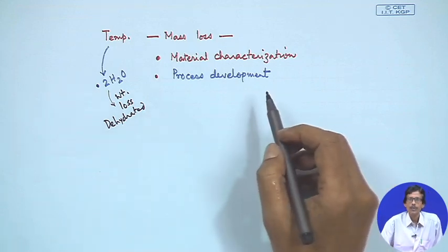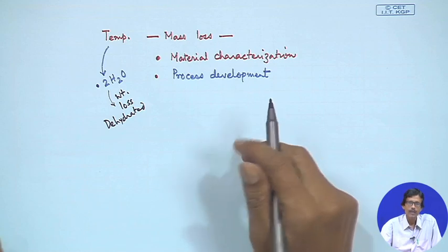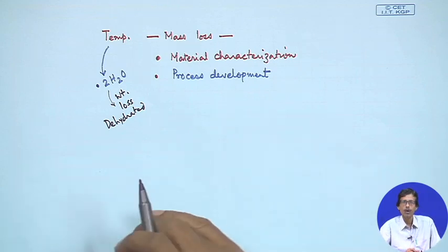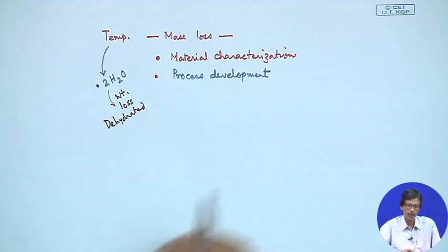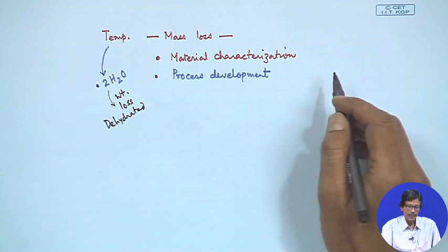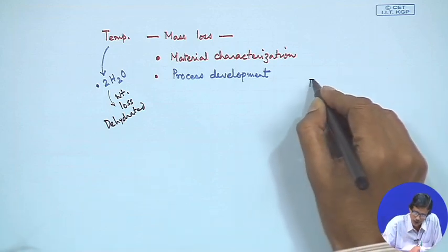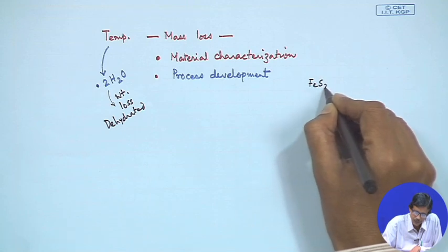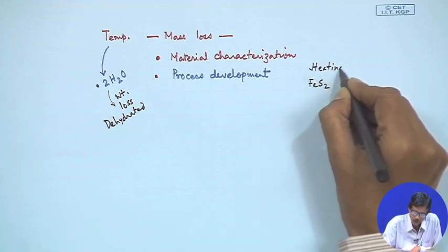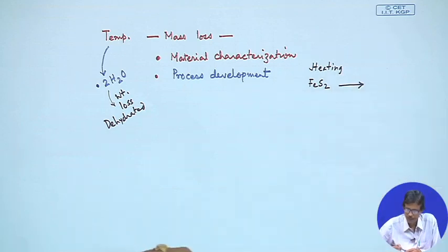So, after knowing this, the dehydration process can take place, and if we have more water molecules, say 5, 6, 7 up to 10 water molecules, we have seen the examples of sodium carbonate. At the same time, something else happens, such as we have seen in the case of heating FeS2. So, what is happening when we heat this particular FeS2 species?